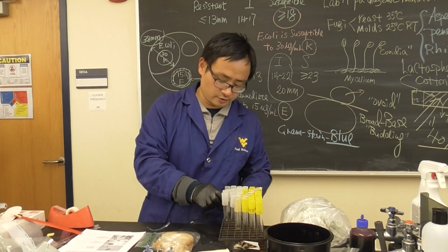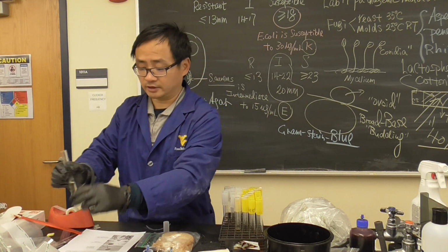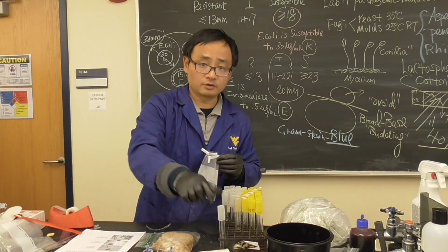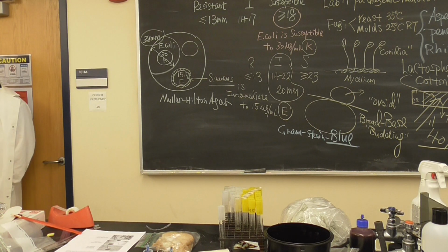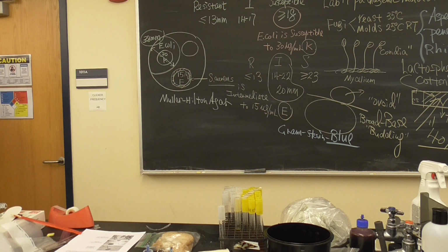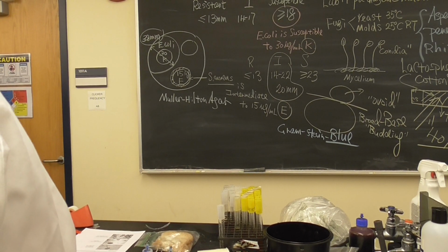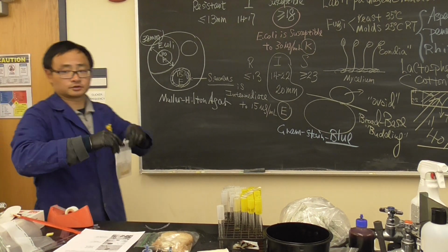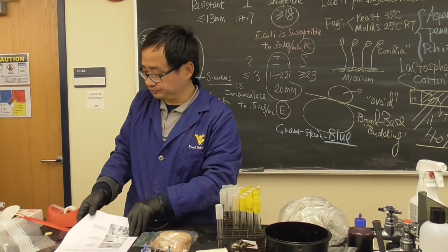Then what I do, I use a very smart way. That's about 10 ml, so we add it. Then we put it on the side. What are we going to do? We're going to go here to do the stomacher. This is for the stomacher. This machine is $2,000. Okay, that's good. This will be the first sample. Who wants to use it? First sample. Okay. Now, what we're going to do is the lactophenol cotton blue.